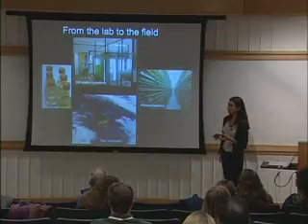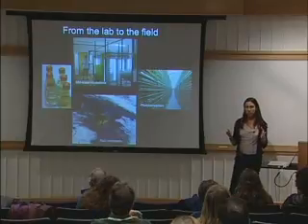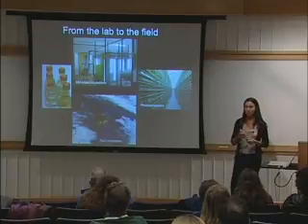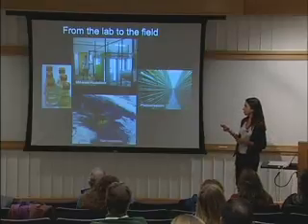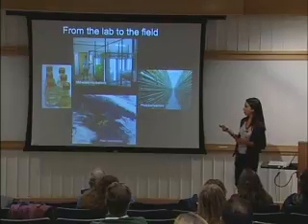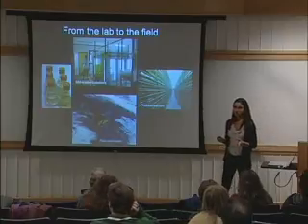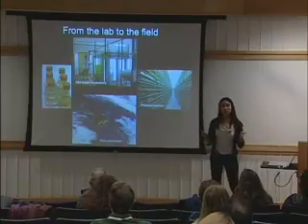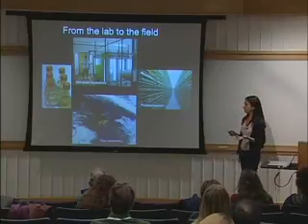One could think about having these reservoirs and using them to get samples for as much as you possibly can. So we tend to grow large volumes. This would be a huge cell density, so we don't work with these kinds of cultures, but with diluted cultures, large volumes, and we harvest material for as many parameters as we possibly can.